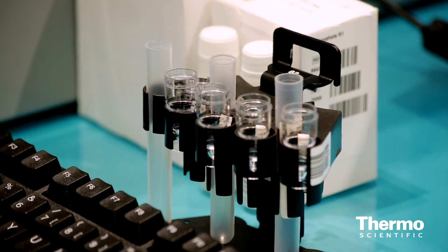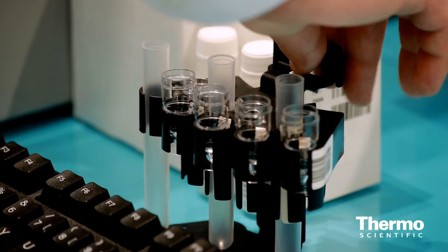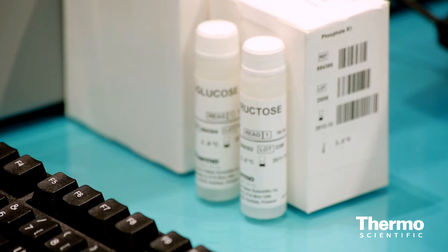We have a lot of system kits and the most used parameters are ammonia, chloride, nitrate, nitrite, phosphate, and sulfate.